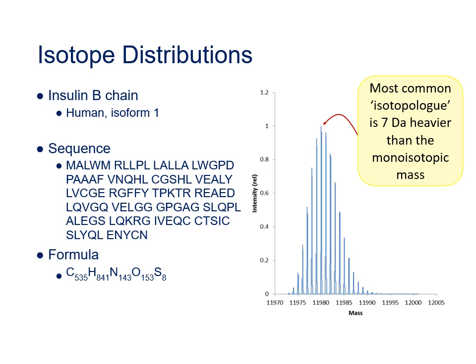And there's a shorthand used to label peaks like this. We tend to call the monoisotopic peak M or A, and the heavier isotopologue peaks by the number of extra neutrons they contain, so M or A plus 1, 2, 3, etc. In this nomenclature, the most abundant isotopologue in this distribution is the A plus 7 peak. A and M are used interchangeably depending on the reference you're looking at.